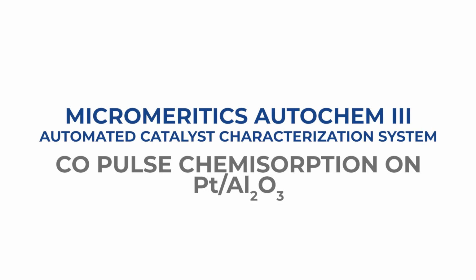And that completes this demonstration on how to perform a pulse chemisorption with platinum alumina reference material on the Micromeritics AutoChem III automated catalyst characterization system.